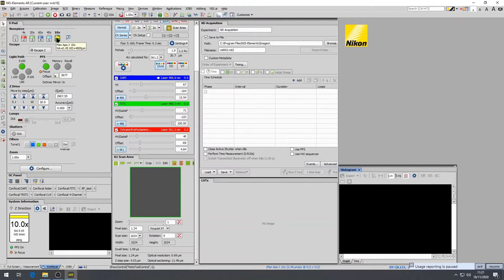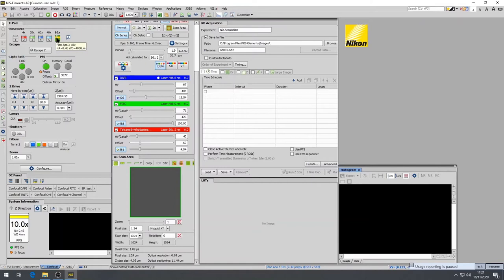Once the immersion oil is placed, place your sample on the stage. First, open the door to the incubator by rotating the handle. Move the condenser backwards to allow better access. Place your sample in the slide holder cover slip down. Bring the condenser arm forward and use the stage controller to move your sample above the objective.